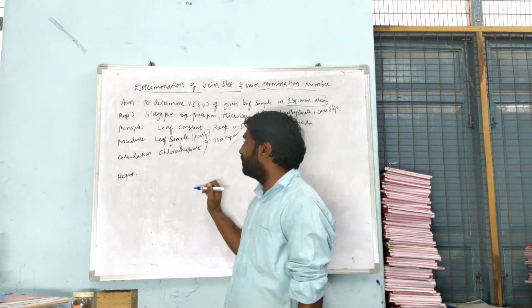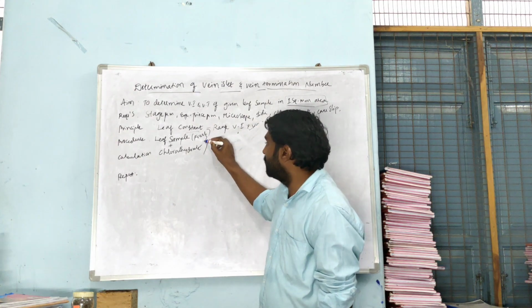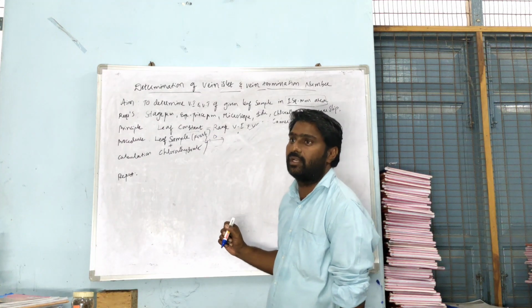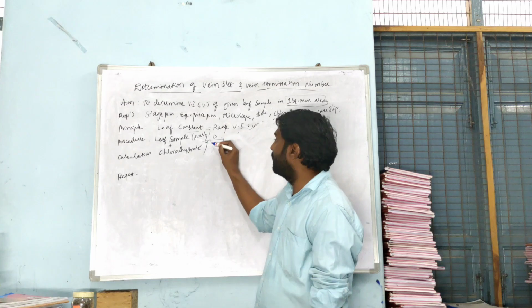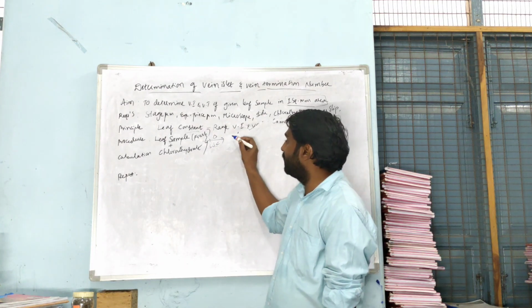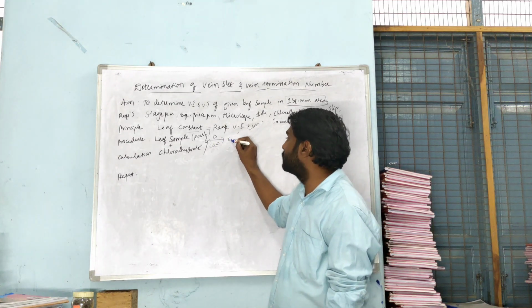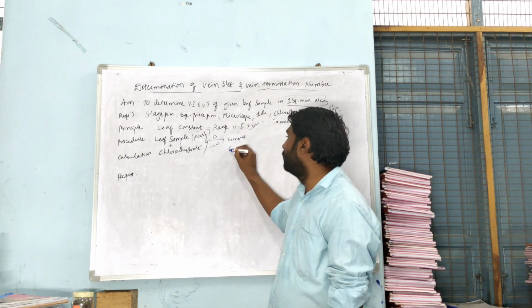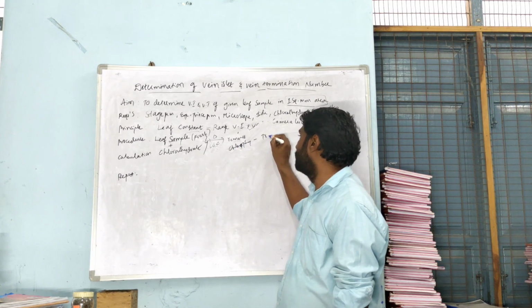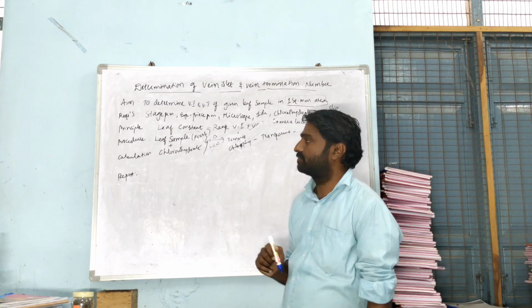So after addition of this chloral hydrate, how do we get the leaf sample? Generally it is boiled using a heating module or by flame at 60 degrees centigrade, where the boiling of the leaf with chloral hydrate removes chlorophyll. Since chlorophyll is removed, you can see transparent leaf cuttings.